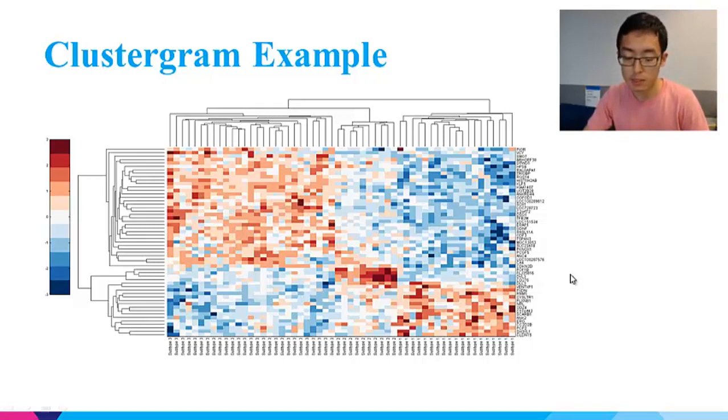This is the same dataset as I used in the PCA plotting. Each column is one tumor cell gene expression profile, and each row is a gene. The color suggests relative expression values, and red indicates higher expression values, blue indicates lower expression values.